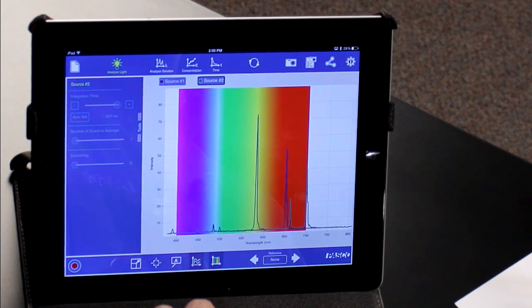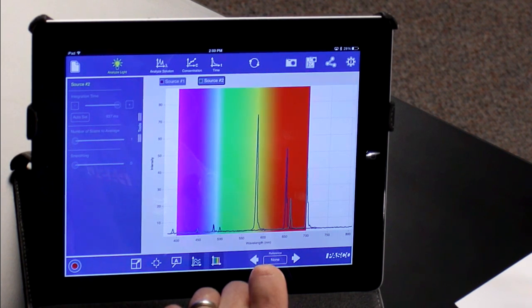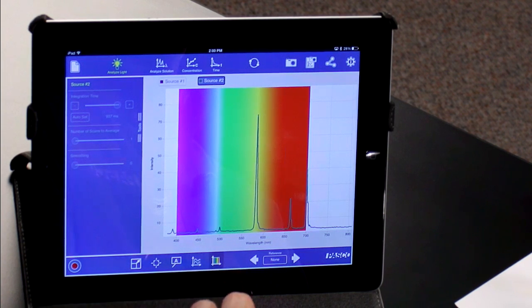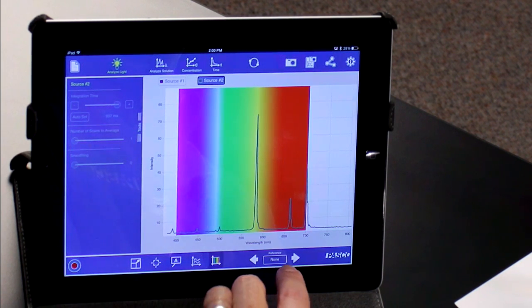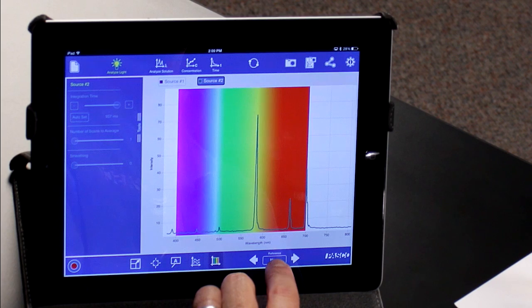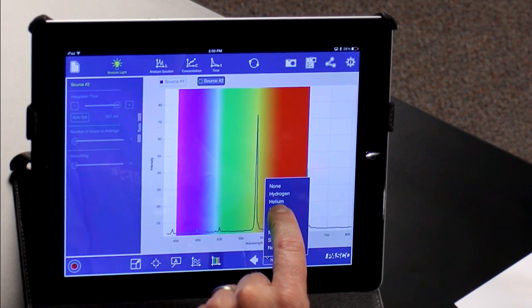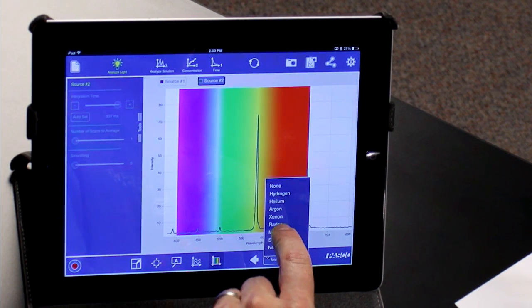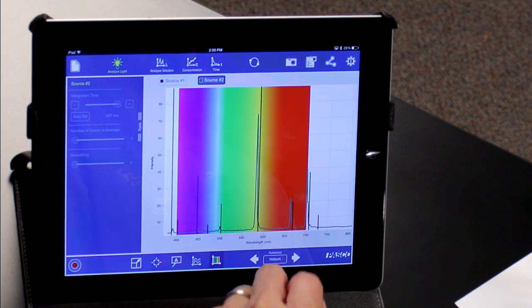The software is built for you to do some comparison and analysis. So I can touch down here and I can overlay the two emission spectra on top of each other. Or if I'm looking at one of the spectral emission graphs, I can put some reference lines on there and see how well that matched up with what I expect to happen for helium.